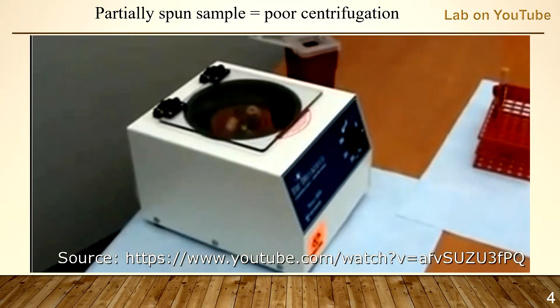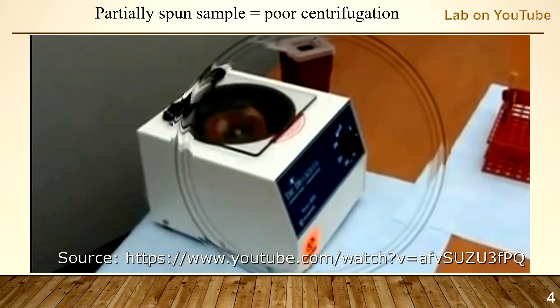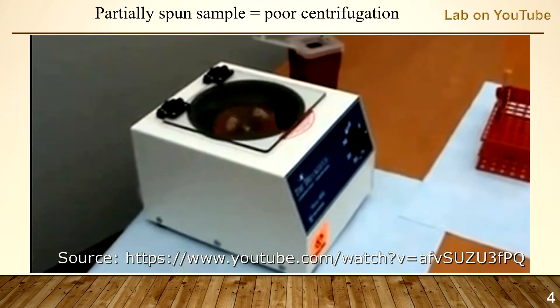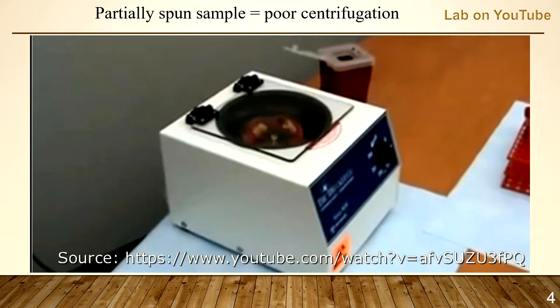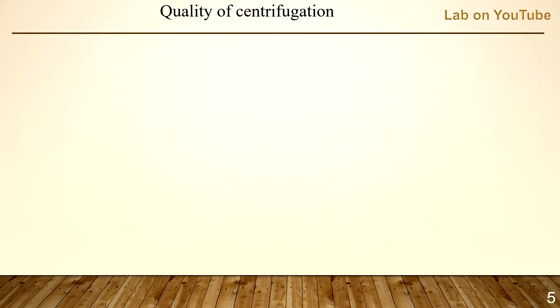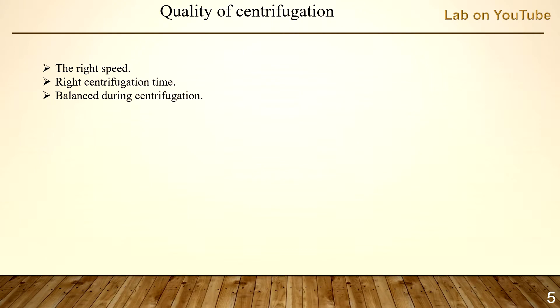Partial spin sample error results mainly from poor quality of centrifugation. You may ask: what are the right conditions to obtain good quality centrifugation? Quality of centrifugation depends on several factors: the right speed, plus the right centrifugation time, plus balance during centrifugation.